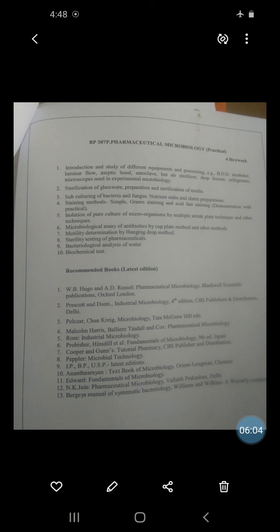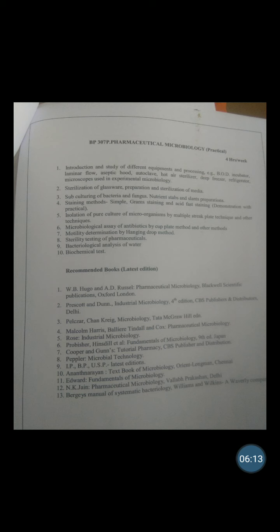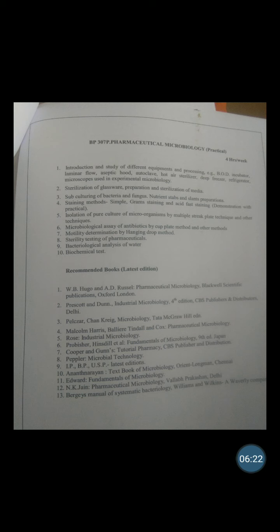This prepared slide is kept under the microscope. Observe the slide through the eyepiece and use the coarse adjustment knob to adjust until the drop edge is seen as an irregular line that crosses the field. Adjust the light using the diaphragm attached to the microscope. Now observe the cells for their morphology — that is, size and shape — as well as their true motility.